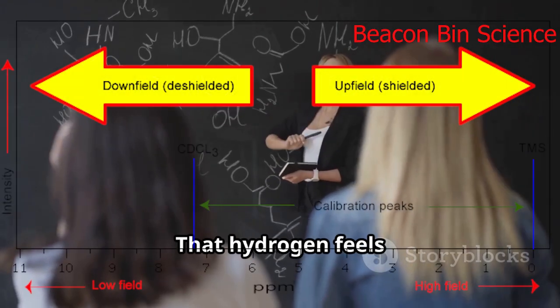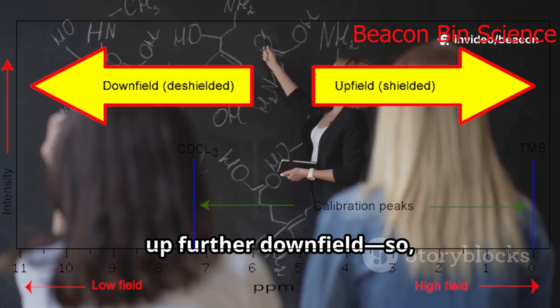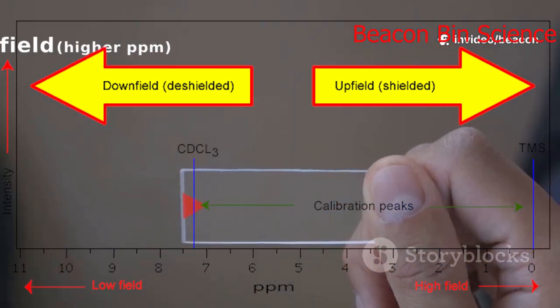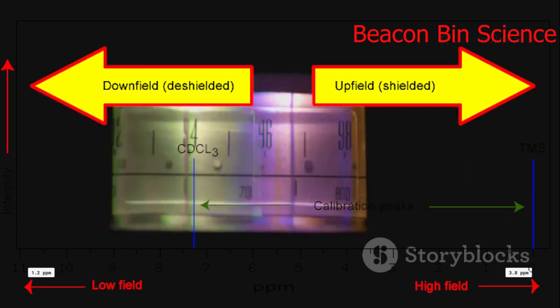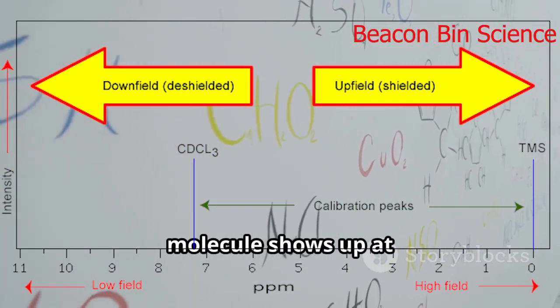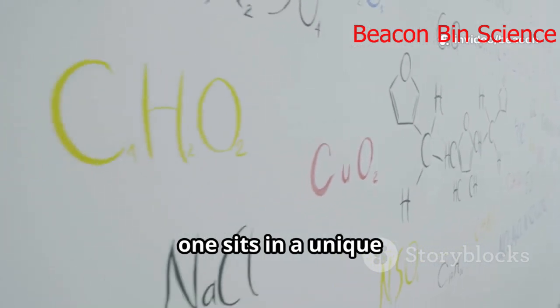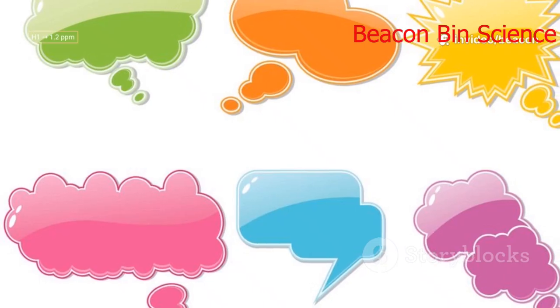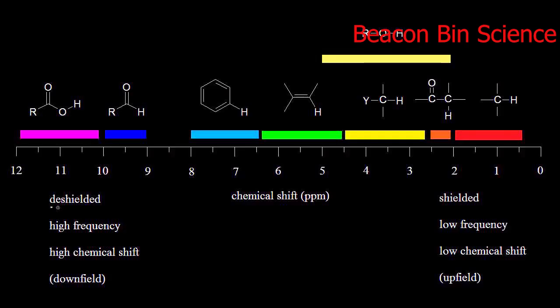That hydrogen feels the force more, and its signal pops up further downfield, so a higher chemical shift. Now, in an NMR spectrum, each unique hydrogen in your molecule shows up at a slightly different spot, because each one sits in a unique electronic neighborhood. It's like every hydrogen has its own little zip code.